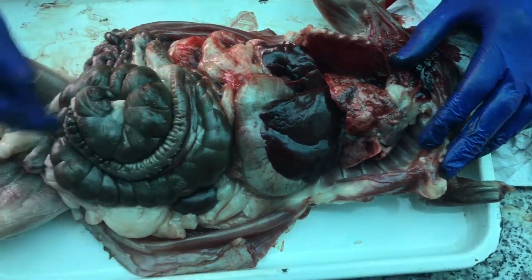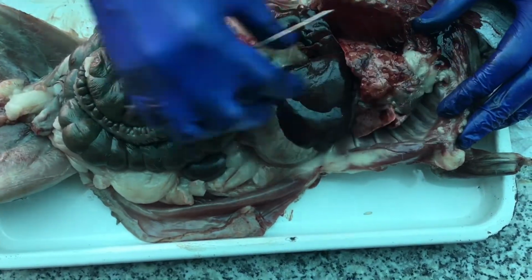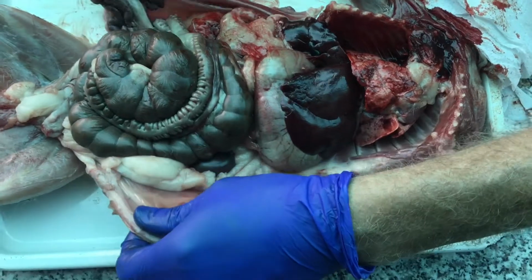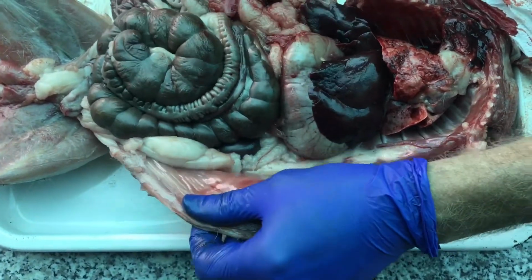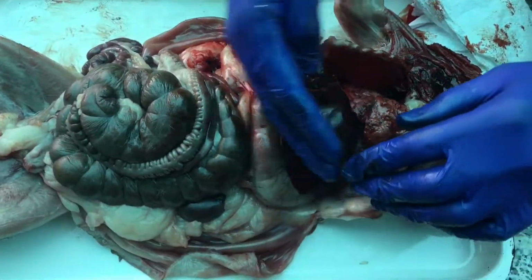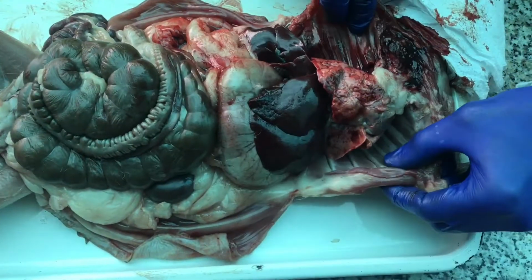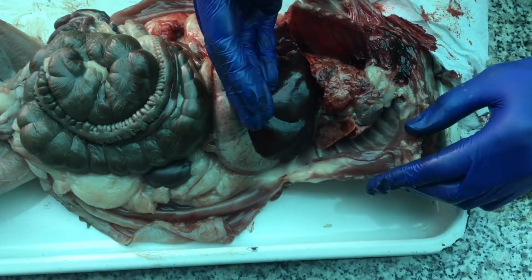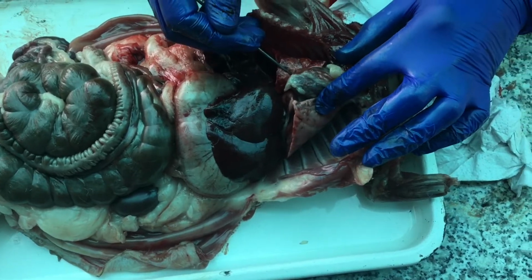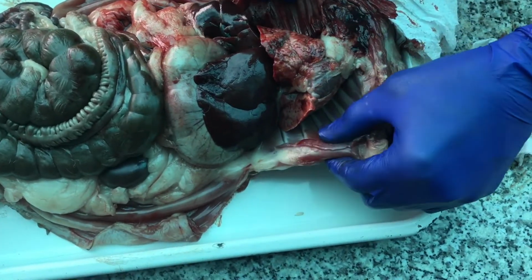Of course, the intestines get all twisted around, the stomach gets twisted around, but it still started from that original tube going down the middle, and the space between them that I've cut into is that coelomic space, or in the adult, the abdominal cavity, inferior to the diaphragm where the stomach, liver, and intestines are, and the pleural or chest cavity superior to the diaphragm where the lungs and the heart are located. Everything is coated with that nice serous lining, that saran wrap layer.